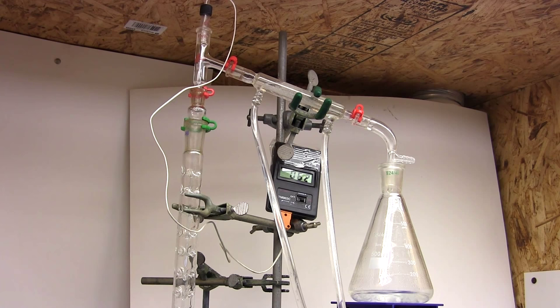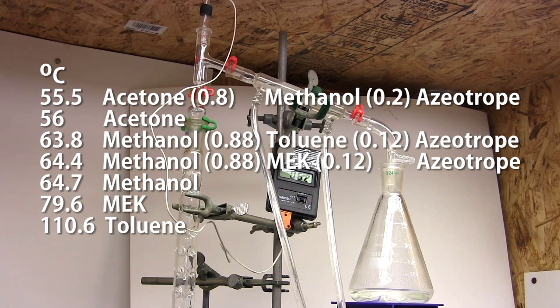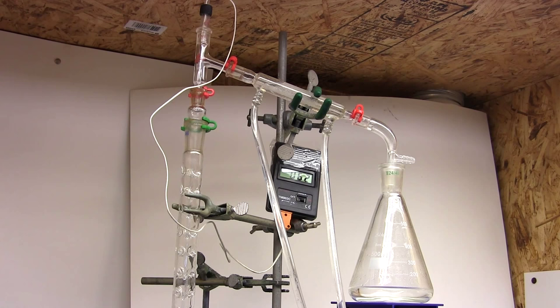Looks like we're getting a nice fraction of methanol azeotropes. Unfortunately since the boiling points are so close together, I'll be unable to tell when one fraction is finished and the other begins due to the poor resolution of my thermometer. Another issue is that my fractionation column might not be good enough to resolve a 0.6 degree difference in compounds.